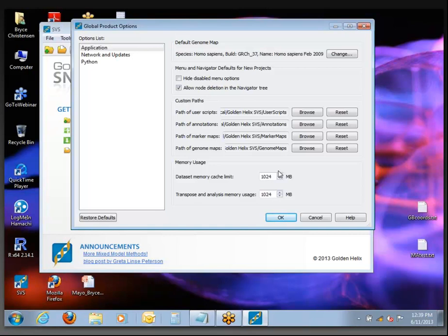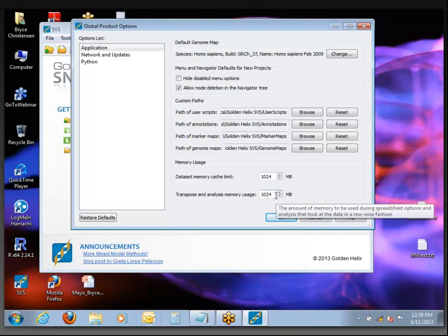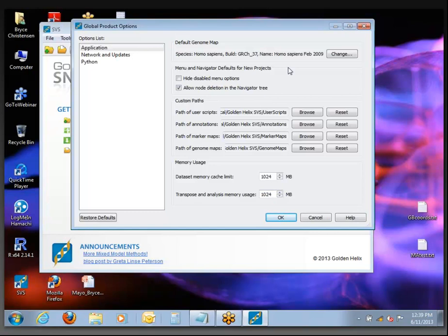64-bit gives you more flexibility in specifying things like memory cache limits. If you are on a computer with a lot of RAM available, there's some optimization that can come from increasing these limits. I usually don't like to get them too big — I find that there's sort of a balance point with being able to maintain good multitasking while also having enough RAM available to be useful.